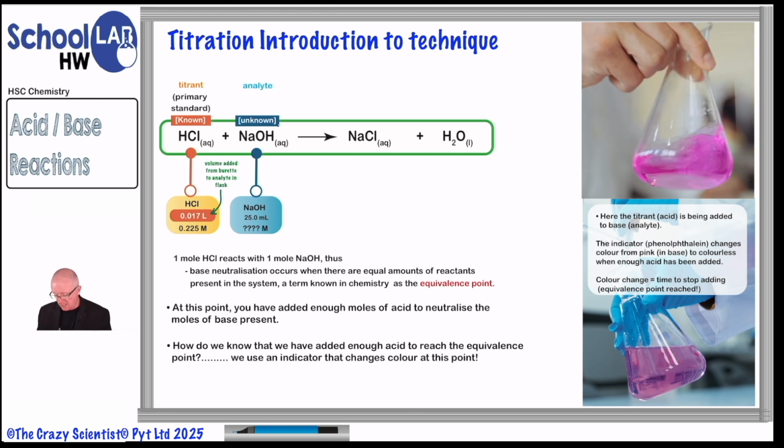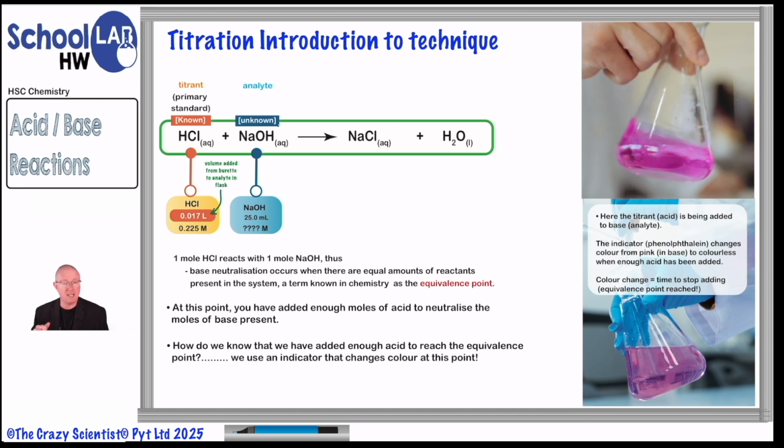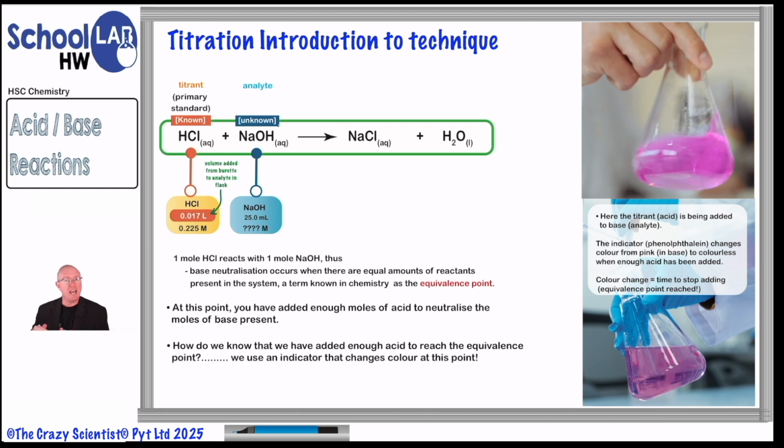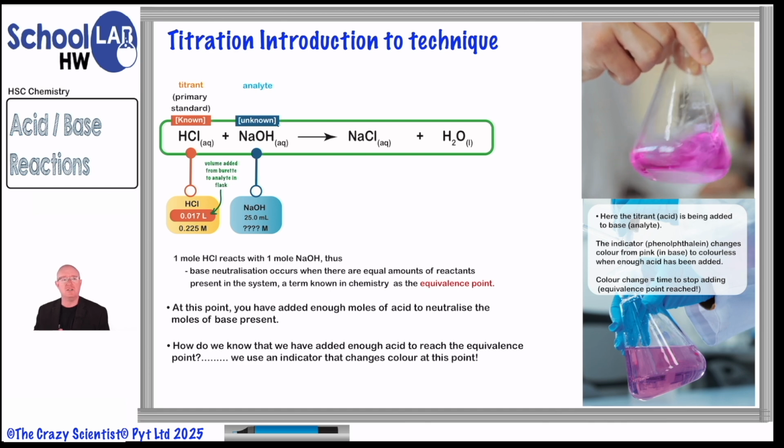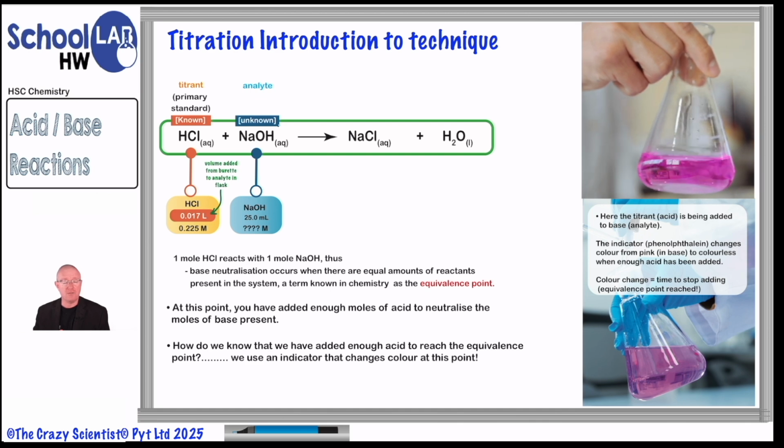And so the one you can see here in the video is they started off with a titration with sodium hydroxide, so the indicator being used is called phenolphthalein. It's pink in sodium hydroxide. As they add the acid to the sodium hydroxide, right, it will change the pH environment of that conical flask.